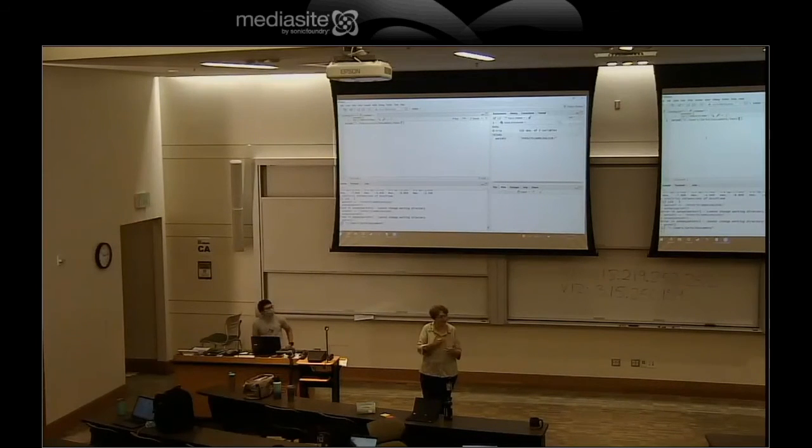Do you remember how we were making scripts and submitting them? And you can do pwd in your script or pwd on command line. Same thing here. You can set working directory there and set working directory here. But until you run the script, it does not happen. So this is like that person who says, I'm going to write a book and never does. Okay? If you put it in the top, you're saying, I'm going to set my working directory, but you're not doing it. What does it is the run button.